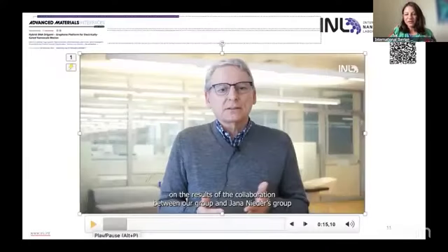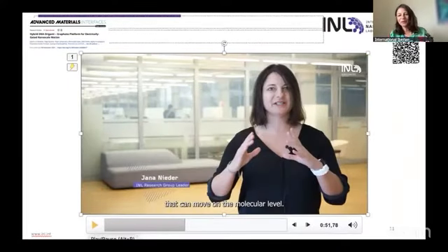This was not enough to us to just follow the molecular dynamics, but indeed we contacted our collaborator, Pedro Ipuim, a research group leader at INL as well, who is an expert in graphene, with whom we did this work. But we asked him to further develop the graphene into a graphene device where we can perform some electrical gating. Now we would like to move our DNA molecules and not only follow their natural kinetics, but to gate the device and to move in a deterministic manner on molecular level the fluorophore up and down.